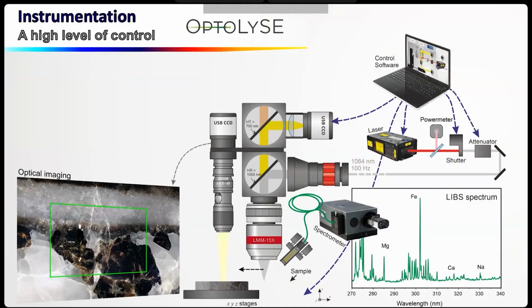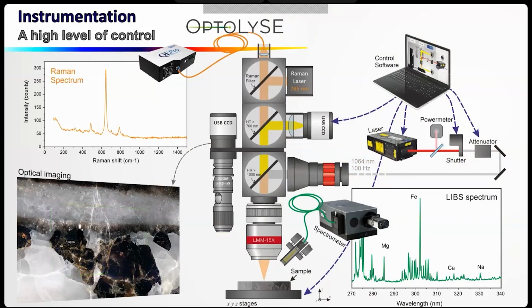From that, the instrument is totally autonomous. You can leave, take a coffee, go to sleep, make a nap, and so on. It's no problem. And there is also a Raman, but honestly, we are not really using the Raman. We are not experts. If you want to do a Raman mapping, you need 1 second per point, so it's 24 hours.